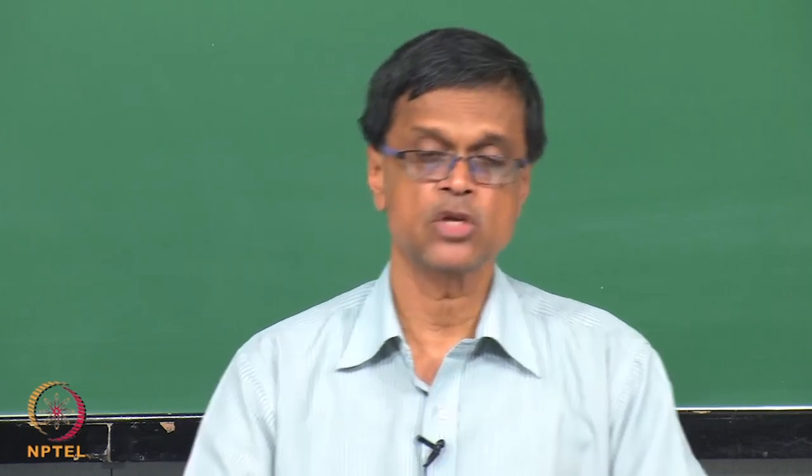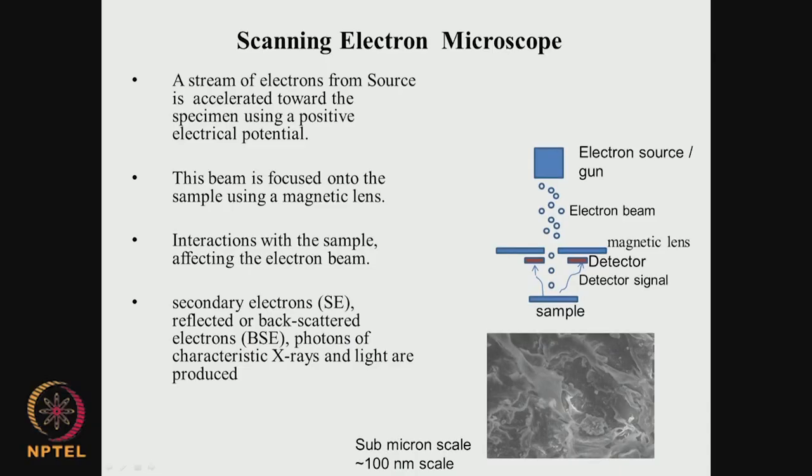So this is what a microscope is, and microscopes are widely used in various areas of biology, and especially the area of biomaterials. It's widely used. Let's look at each one of them a little bit in more detail. The scanning electron microscope. What is the scanning electron microscope?